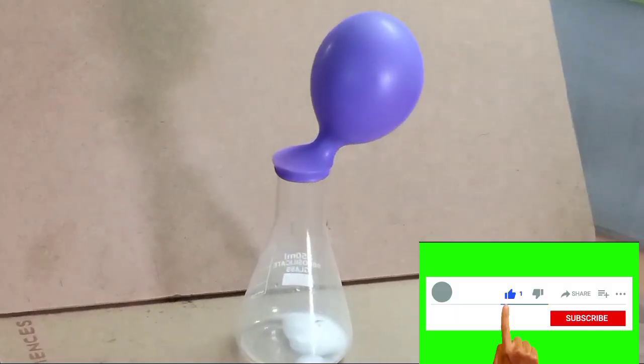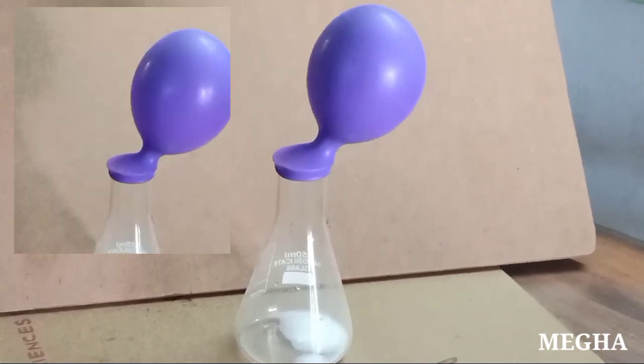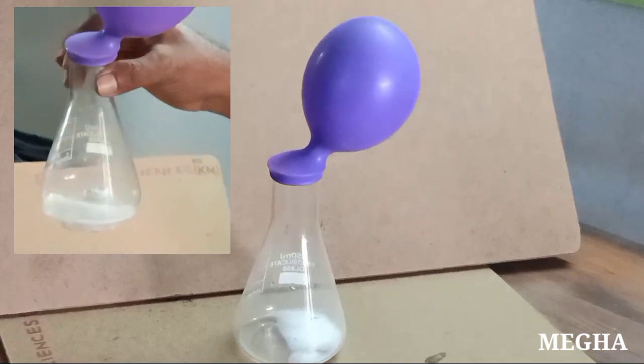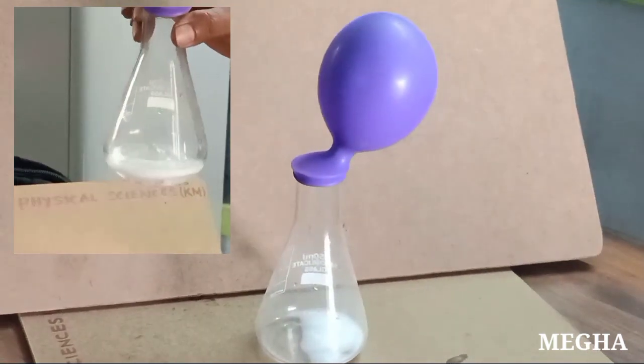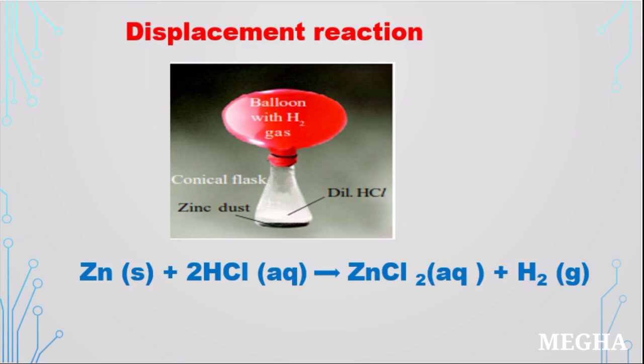Wait for a few minutes. Here HCl reacts with zinc granules and liberates hydrogen gas. Let us write the chemical equation. It is a displacement reaction. Zinc Zn plus hydrochloric acid HCl gives rise to zinc chloride ZnCl2 plus hydrogen H2.